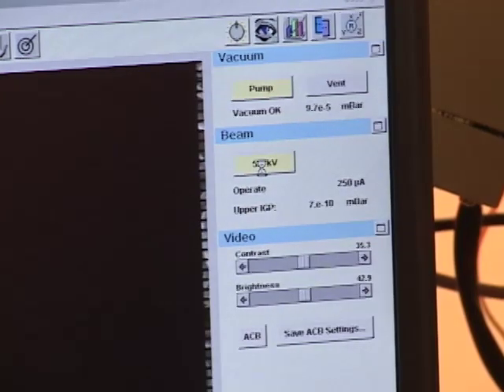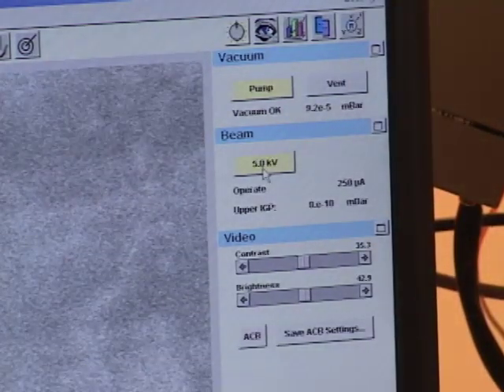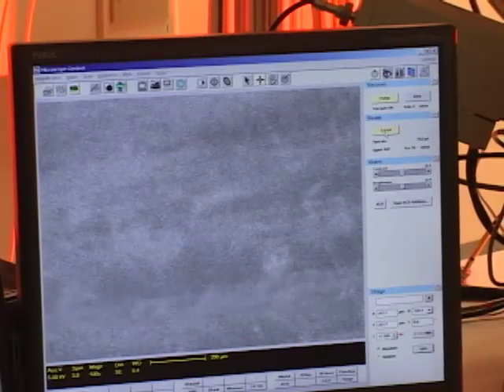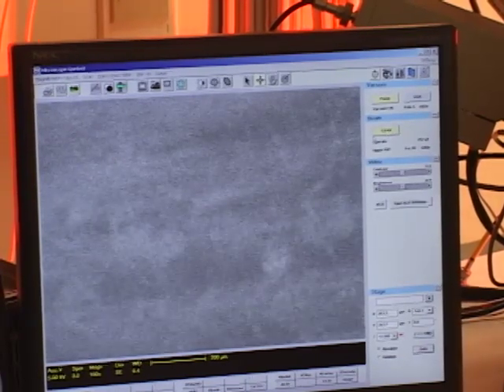So once it reads vacuum okay, I can start the beam by clicking on this 5kV button in the beam submenu. When I do that, you hear the column valve open. That means the upper column is open to the chamber and the beam is coming through to hit the sample.